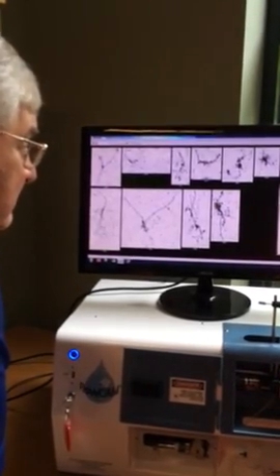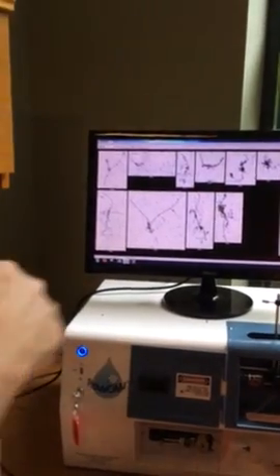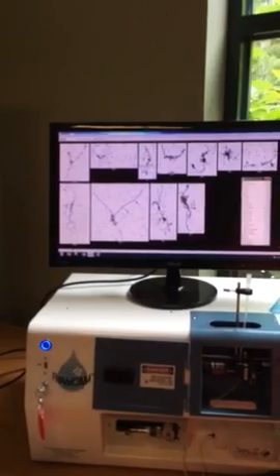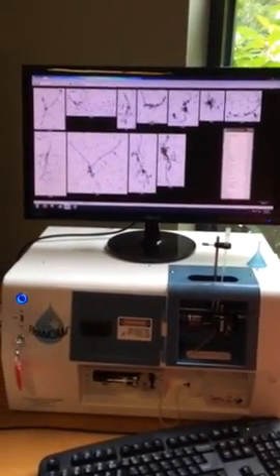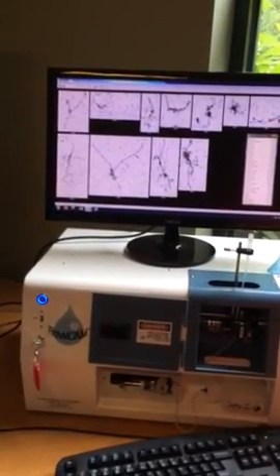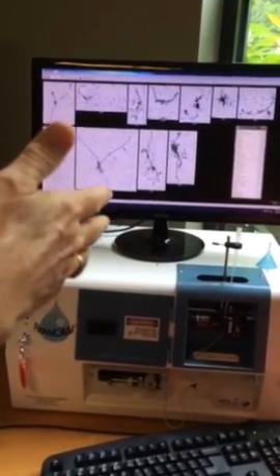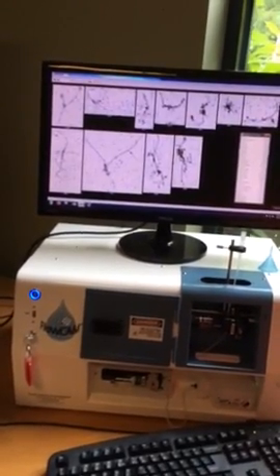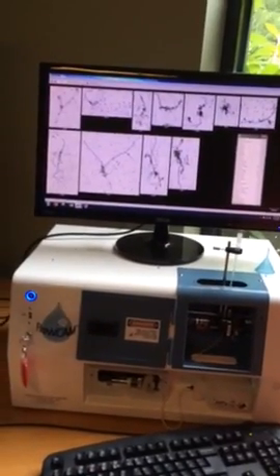Because in the trailer, we get perfectly isolated and super sterile samples from the university. It would be helpful, when we first get the samples, to put them through here and make sure there's nothing in there. And then as we're growing them up in the trailer, getting ready to inoculate the large tanks, to see if there are any impurities or invasives. I would be surprised if your cultures prior to introduction into your tanks really are pure. It's tough. I would never think it was.